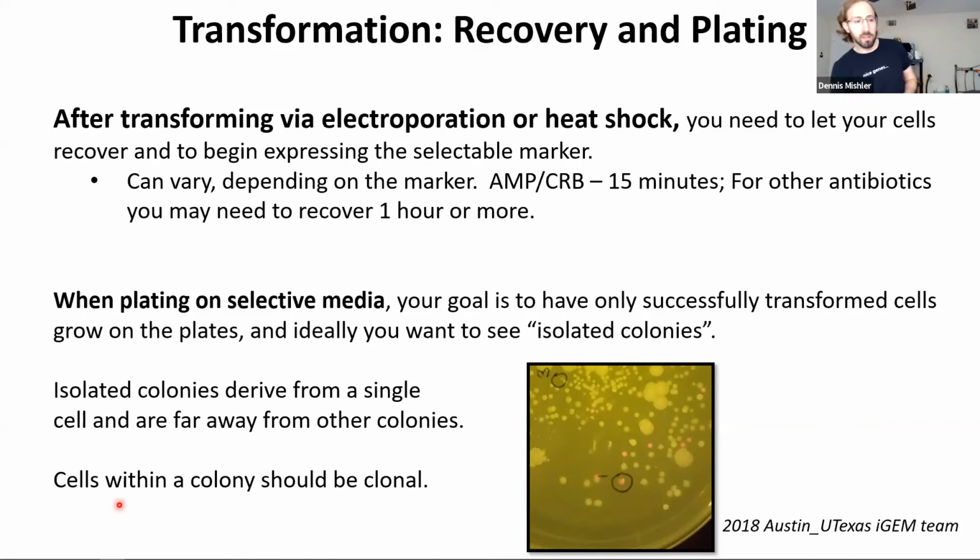Now, the time varies quite a bit depending on the selectable marker. In general, for ampicillin or carbenicillin, which are both beta-lactams, you can just do a small, short recovery, like 15 minutes, and then you can plate and you're good to go. For most other antibiotics, though, you really want to do a recovery for about an hour, sometimes more. But you just want to read about your own antibiotic and what to do based upon your experiment.